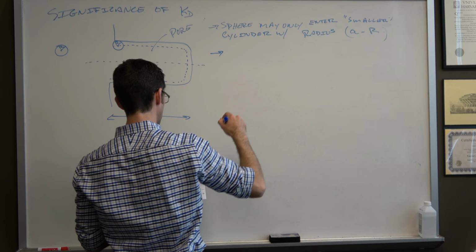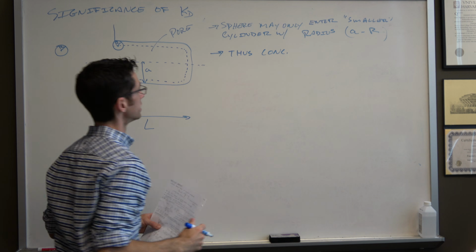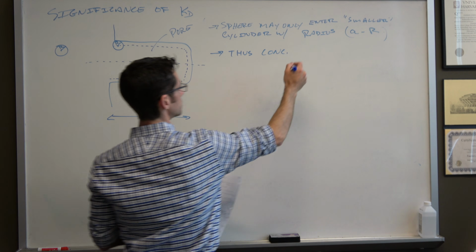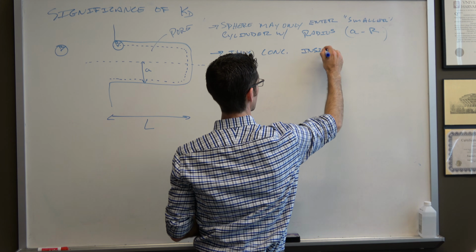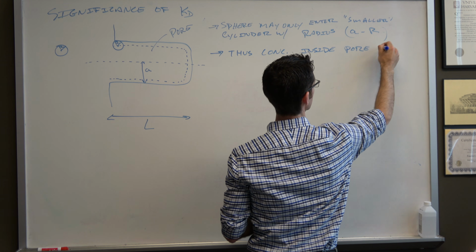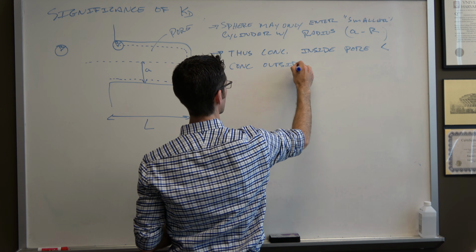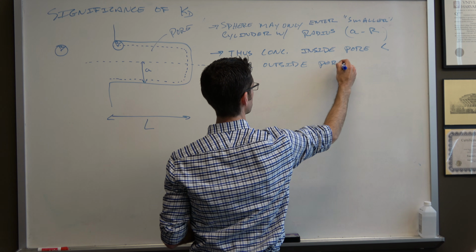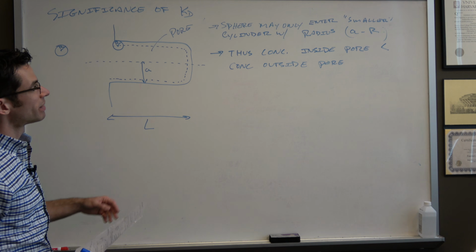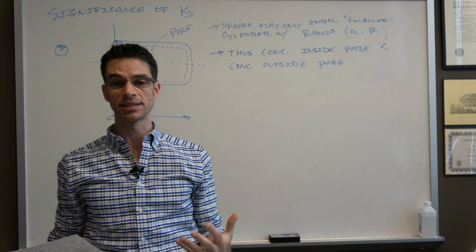And thus the concentration inside the pore is always going to be less than the concentration outside the pore. And the amount that it's less inside the pore is going to depend on the size of the solute.